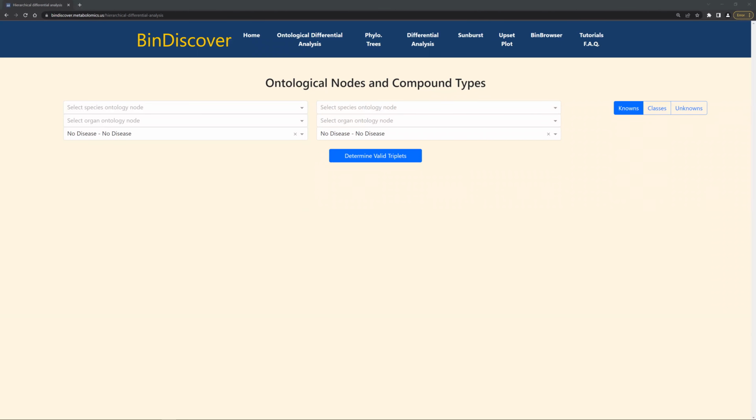Hi, in this video, we'd like to walk through performing an ontologically group differential analysis combination from scratch. So we're on the ontologically group differential analysis tab, and what you can see that you start with are boxes over here with options and boxes over here with options, and then one of three different options over here.